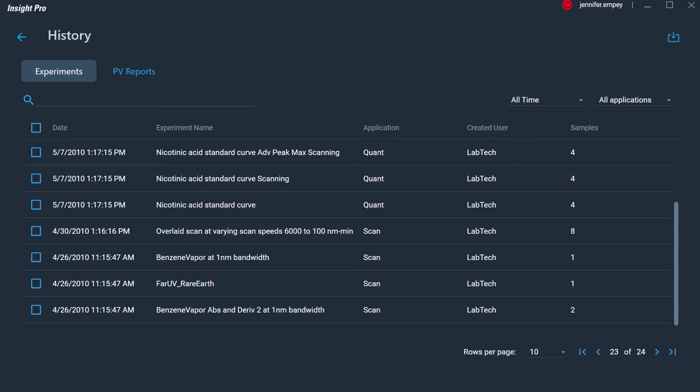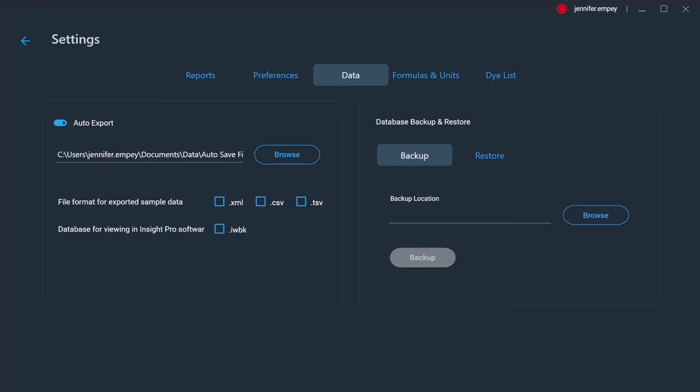The ability to restrict access to applications and features within the Insight Pro software, require signatures, and record logs for audit purposes are included in the Security Suite software compatible with Insight Pro, further complying with 21 CFR Part 11. A backup location for the database can be selected as well as a secondary automatic export path.